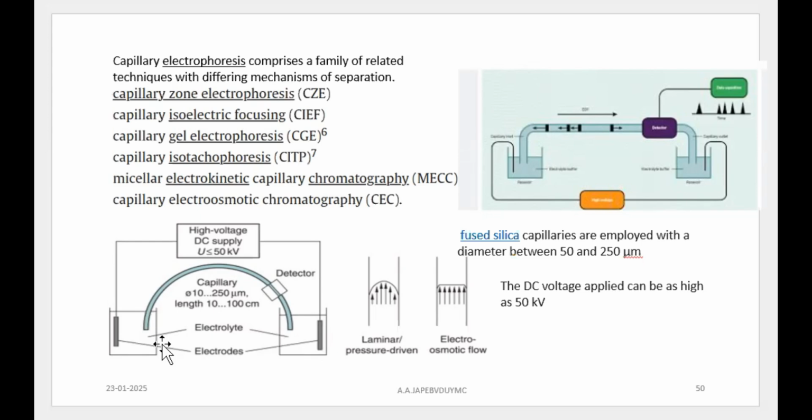What do you mean by plug? Say, for example, an agar block, if I take it, can be called a plug. But here you are going to use a small plug of sample solution, and it is introduced into the anode end. You are not going to take agar, but some small material that is going to carry your sample, right? Of course they are available. You have to inject your sample into that. They are readily available along with the kit or the instrument itself, right?